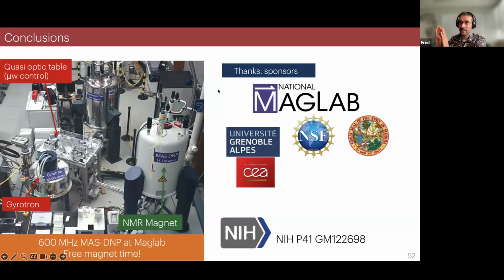As a side note, yes, I designed one biradical with one triradical where things were rigid enough. And actually, the triradical was worse than the biradical because of the weak coupling in between, so you had two strongly coupled and two weakly coupled. And this weak coupling messed up everything. So it was better to have a biradical where everything is under control than having a third one, which is almost like an aggregation effect of the radicals.